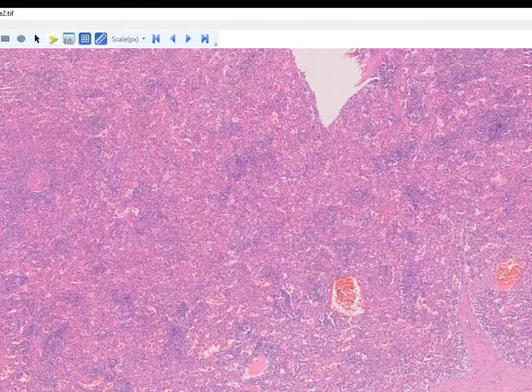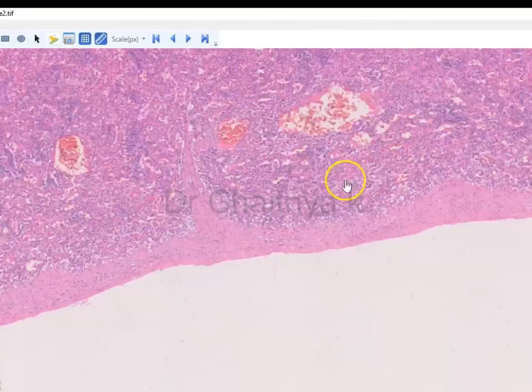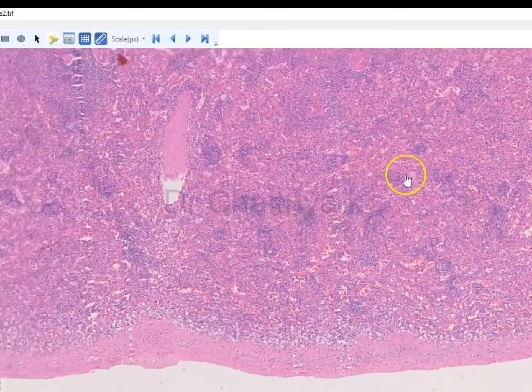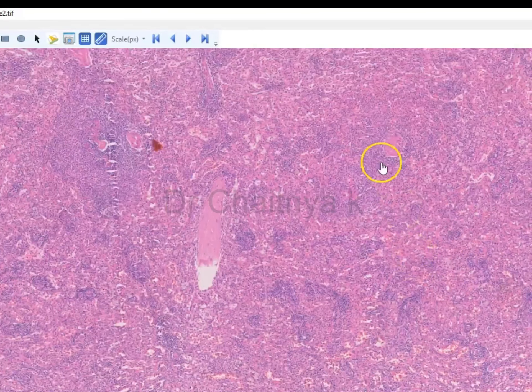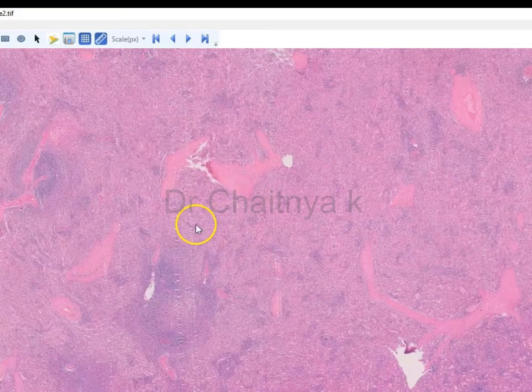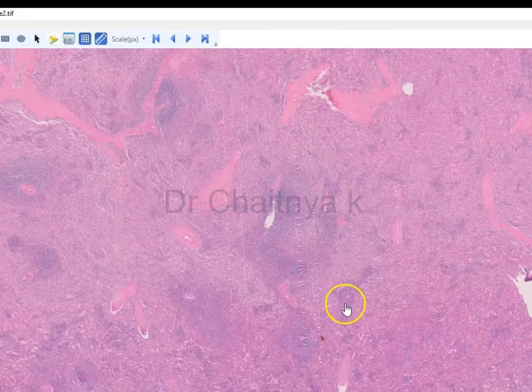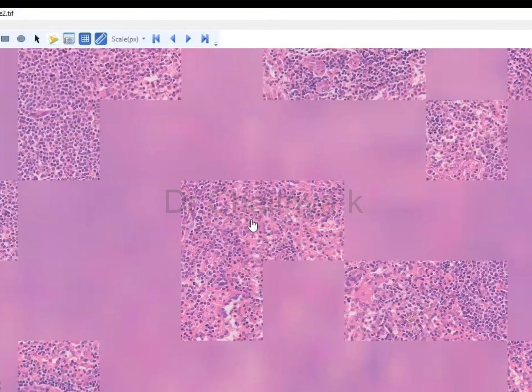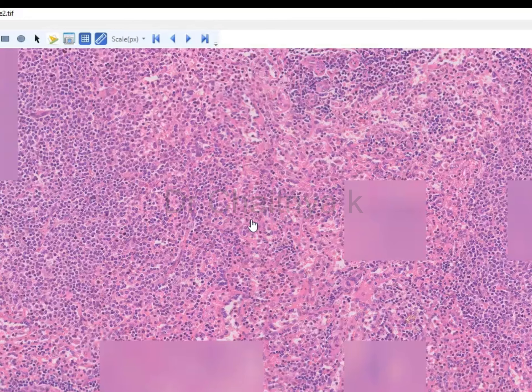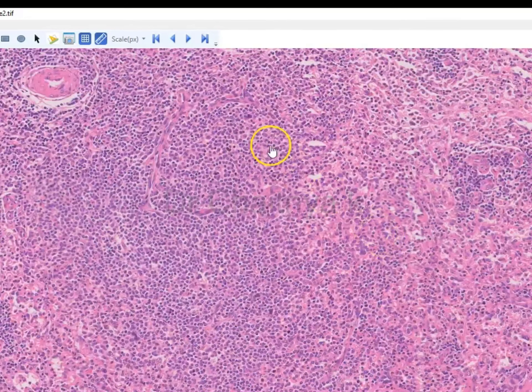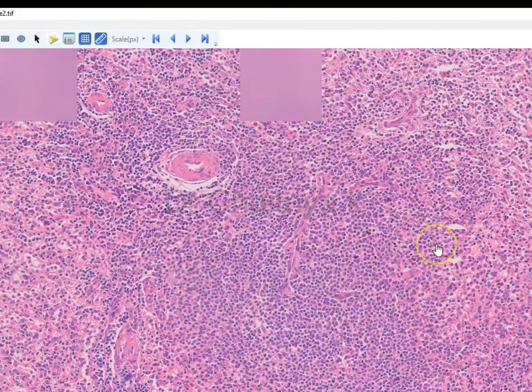It's very simple to understand: the blue dots represent the lymphocytes and the pink granular material is the cytoplasm of the macrophages. Lots of aggregation of lymphocytes is called a follicle, and many of the follicles are intervened by small arterioles with surrounding macrophages.